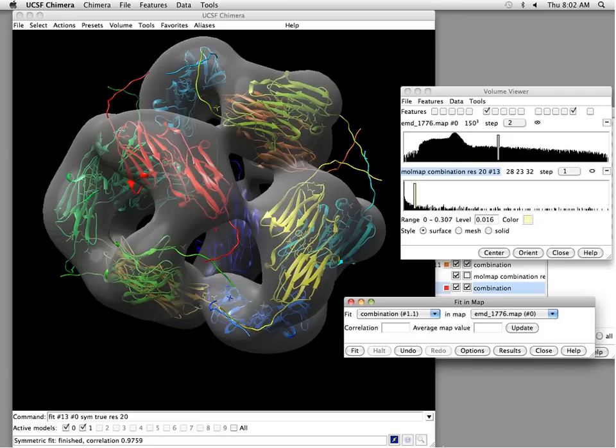I'm going to show you the software that my lab develops. There are 5 of us who developed this program called Chimera, and it's used for looking at 3D molecular models, viewing them, analyzing them, making images and movies that you would use as figures in a journal article, or movies as supplementary material, also used in talks, so presentation type, illustrating the results of your work on molecular structures. Chimera has hundreds of capabilities for doing analysis of structures, and I'm only going to be able to show you a few in this next 20 minutes.